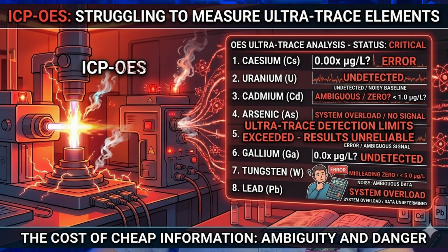Before we finish with the ICP analysis, I would like to also mention that there are elements that are either extremely difficult or practically impossible for ICP-OES to measure accurately at natural reef concentrations. Examples include uranium, cadmium, arsenic, lead, etc. Technically, some of these elements can be measured by ICP-OES under lab conditions, but not at the ultra-low concentrations found in reef aquariums. That's where ICP-MS has a massive advantage.